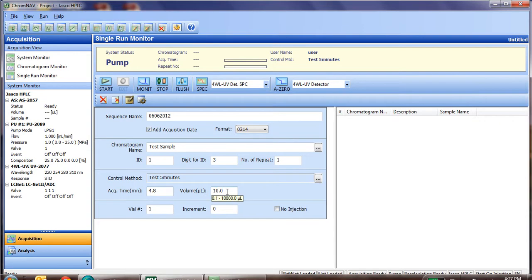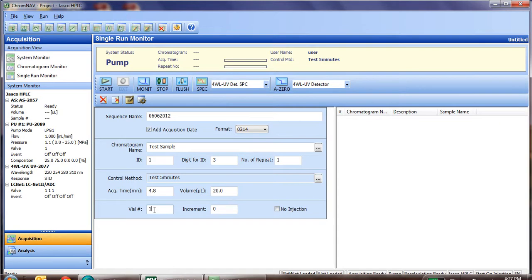We'll next need to set the injection volume. In this case, we're injecting 20 microliters. The last step is the vial number. We'll be running from vial position number one in the auto sampler, so we leave it at number one.